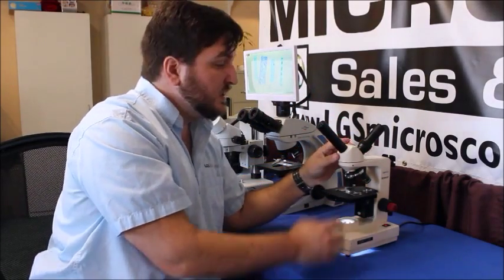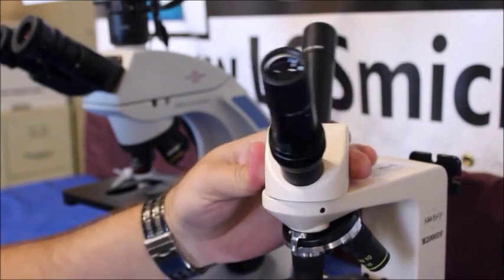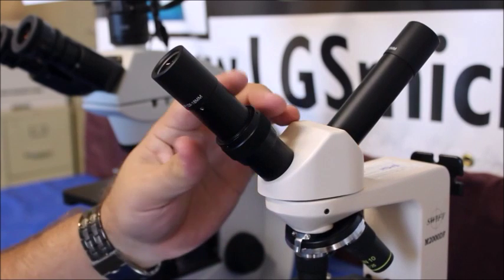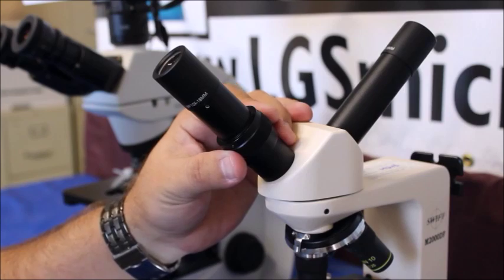So now what we want to do is set it up for the second person. Now we're going to swing this around and you'll notice that this other eye tube has this ring on here and as you turn it it will move the eyepiece in and out.